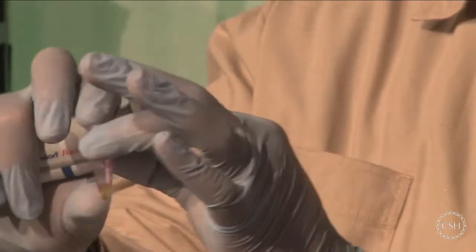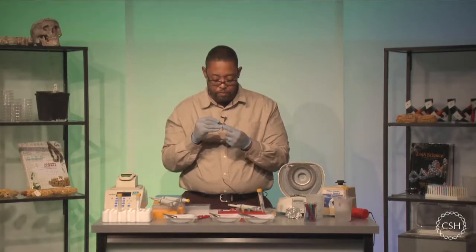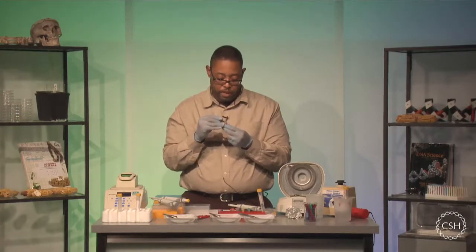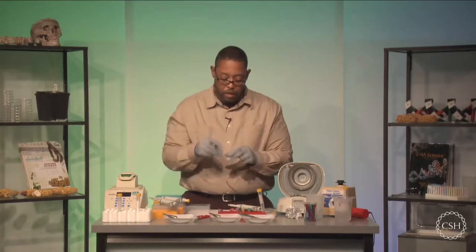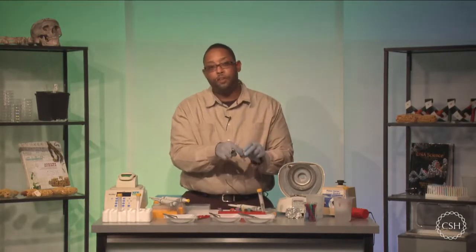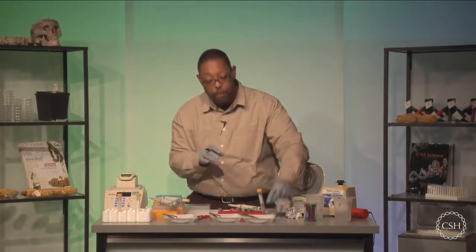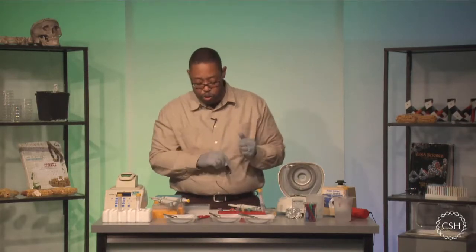So now that I've added that supernatant to a fresh test tube, I do need to label it. That's one. And that it is my plant. But I also want to make sure that I'm taking the old one. I can either store it, or if you're sure you're not going to need it, you can throw it away. I'm just going to push it off to the side, because I may need it in the future.